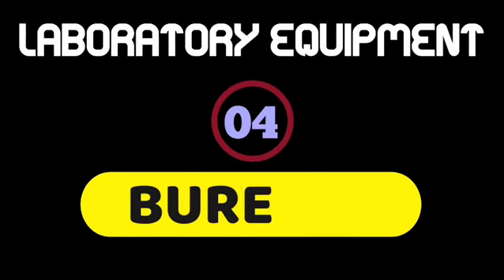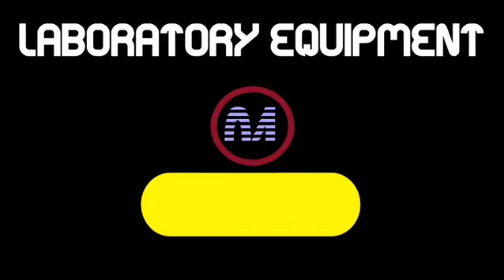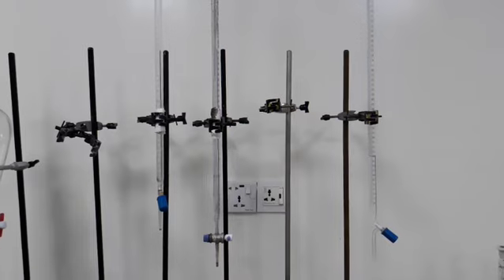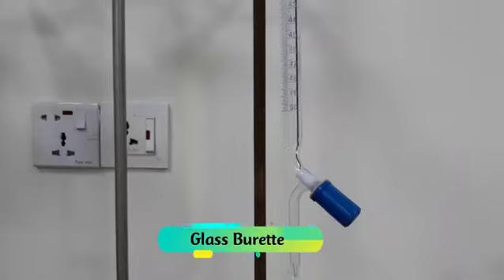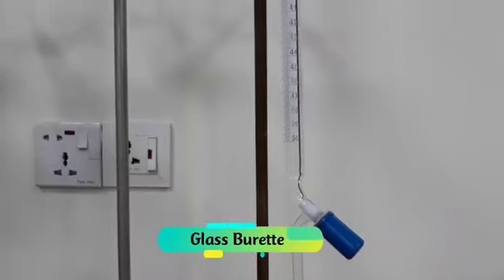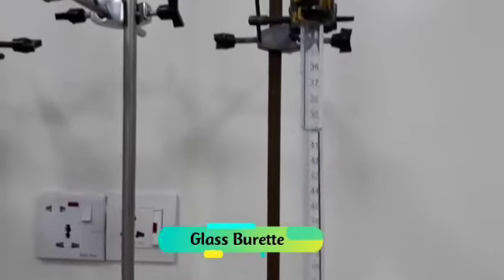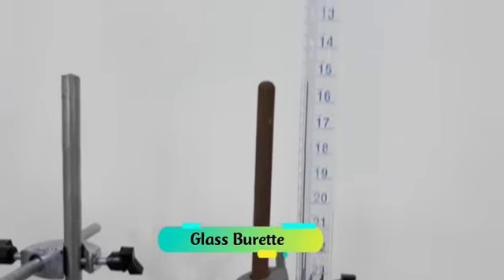Next we are going to see the burette. A burette is a long graduated glass tube with a stopcock at the bottom, used to deliver precise volumes of liquid, especially in titrations. Mostly the burette is made of two materials: one is glass, the other is plastic. The glass burette is mainly used in chemistry experiments.